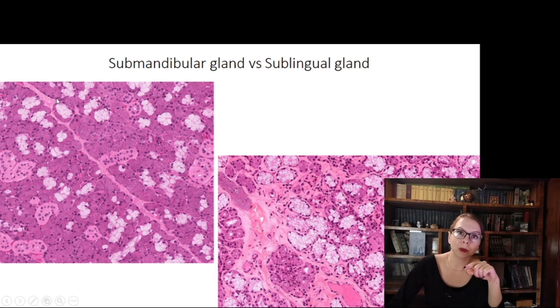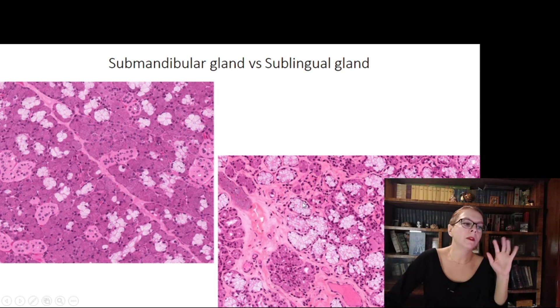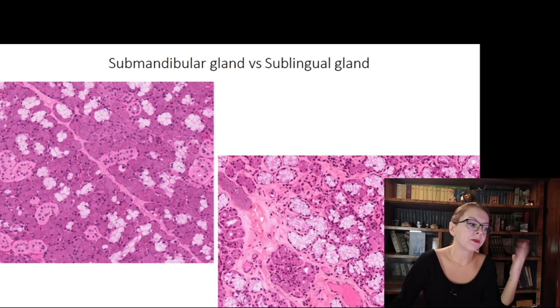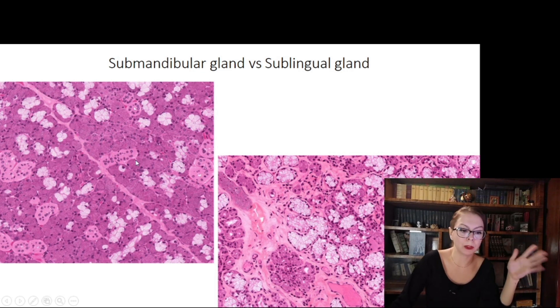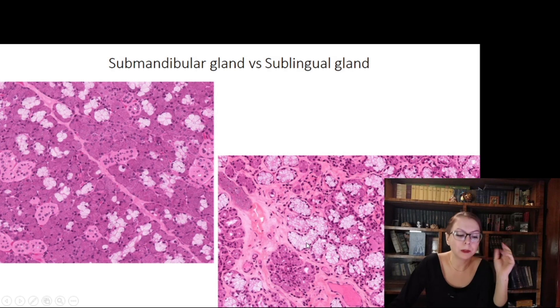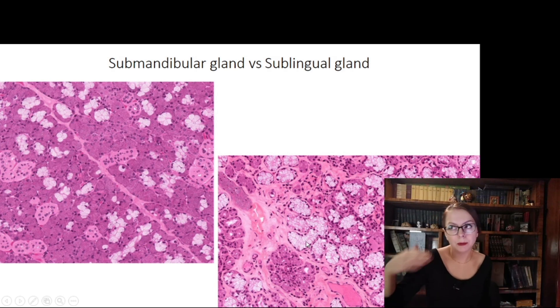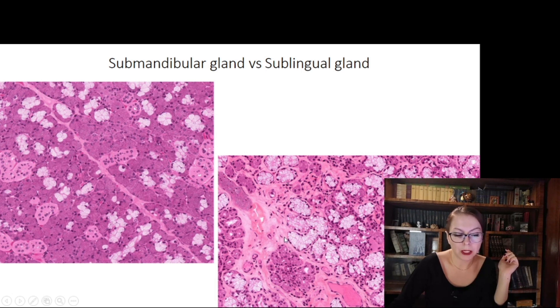The submandibular and sublingual glands are very easy to confuse — be attentive. The difference is only in the ratio between serous cells and mucous cells. In the submandibular gland, serous cells predominate significantly and can be seen in a basophilic, purple color. If purple, basophilic cells prevail over empty mucous-producing cells, this is the submandibular gland. In mucous cells, the cytoplasm is transparent — not acidophilic but transparent — because mucus along with glycoproteins is dissolved and removed during specimen preparation, leaving an empty cytoplasm with nuclei shifted to the periphery.